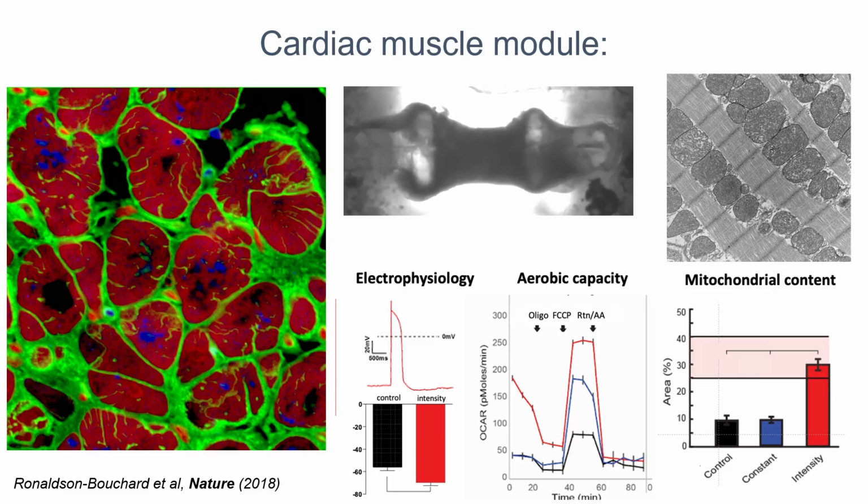So we've been making a heart muscle for many years now, again starting from iPS cells. You derive cardiomyocytes, you derive supporting cells such as cardiac fibroblasts and endothelial cells, and more recently resident macrophages. We encapsulate these cells into hydrogel that is designed to mimic the heart matrix. And what we do in culture is after the muscle assembles, it takes about up to 1 week.